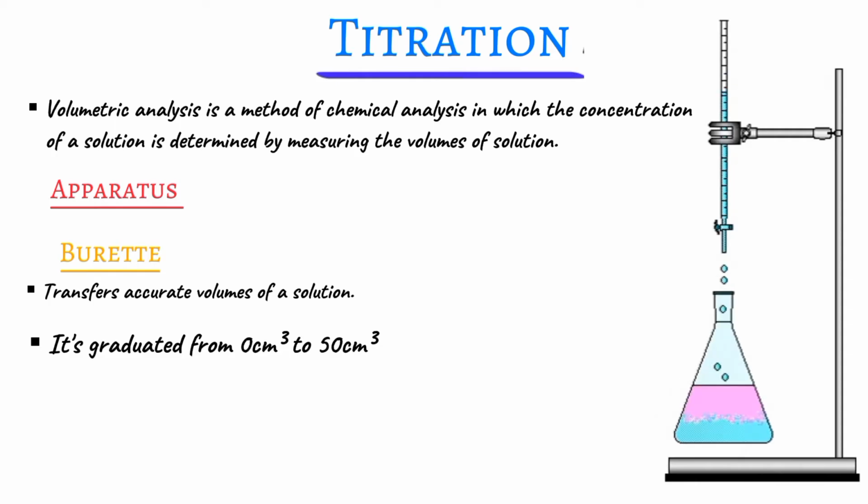When you see the reaction nearing the endpoint, you're supposed to slow down the flow of the titrant such that you add 1 drop at a time and swirl after every drop until the endpoint is reached. Just a reminder, how do we know the endpoint has been reached? Because we are going to observe a change in the color of the indicator.